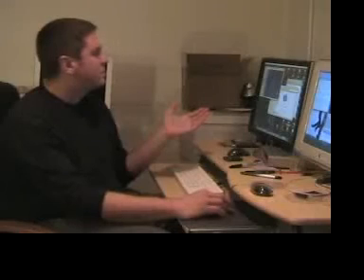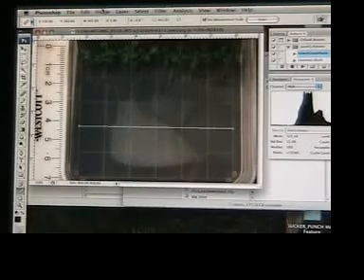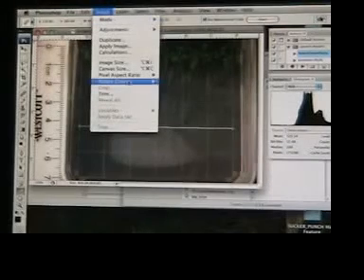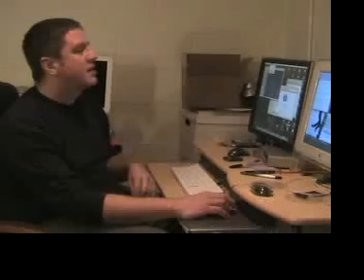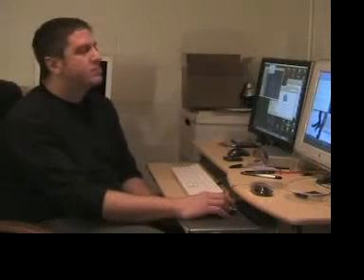Click on the far left vertex and drag to the far right. A line with a plus sign at either end should result. Now under the image drop-down menu, select Rotate Canvas, Arbitrary, and a dialog box should pop up with a small, possibly fractional angle amount highlighted in blue.